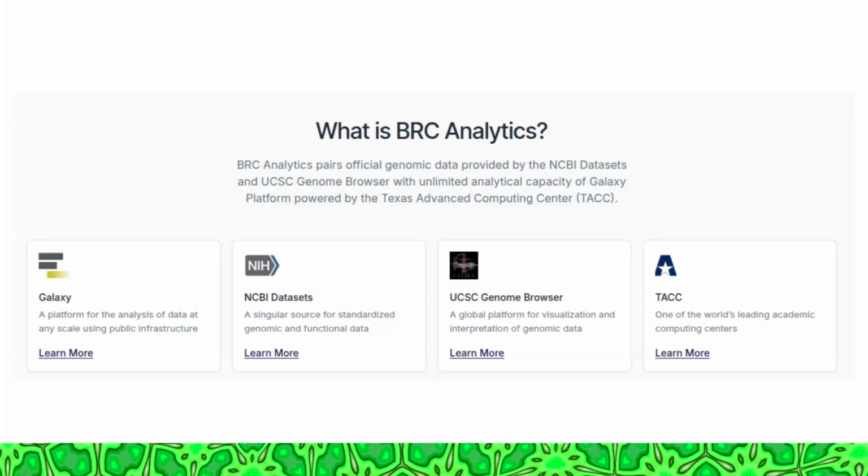In doing this, we rely on data from NCBI. In particular, we have very good, tight interaction with the NCBI Datasets team, with the NCBI Comparative Resource Group. We also have existing collaborations with NCBI SRA and other places. NCBI, of course, is not technically part of this, in the sense that it's a funded project and it's funded by NIH. So I guess NIH cannot be a part of an NIH funded system, but we're collaborating with NCBI very closely.